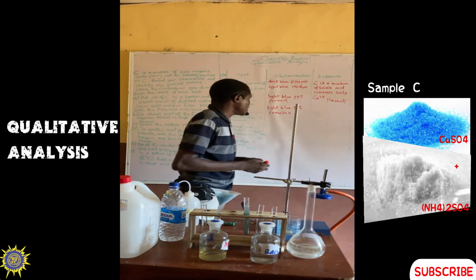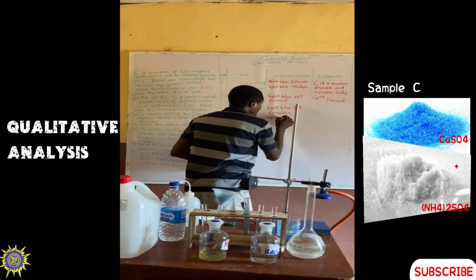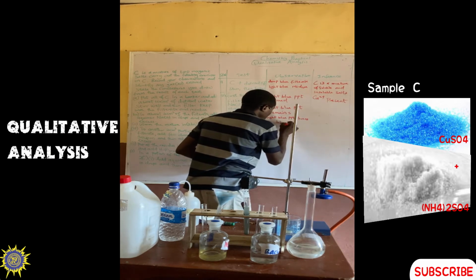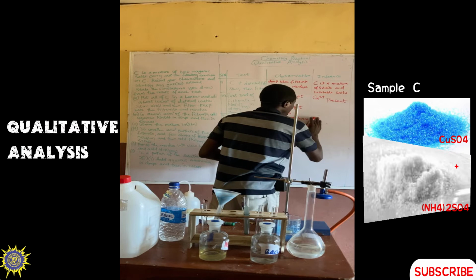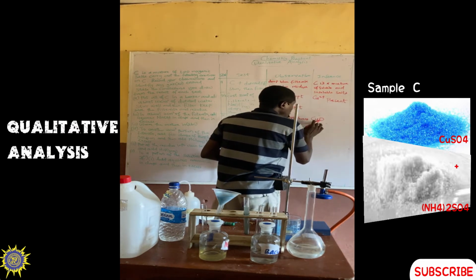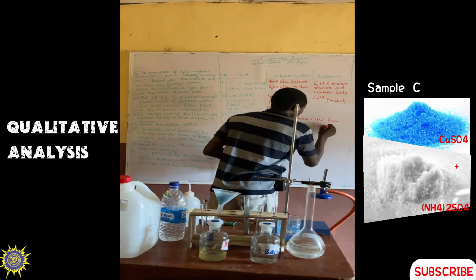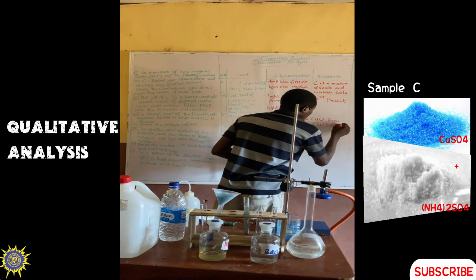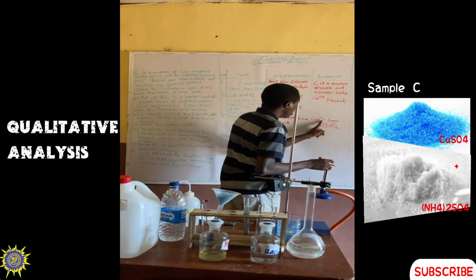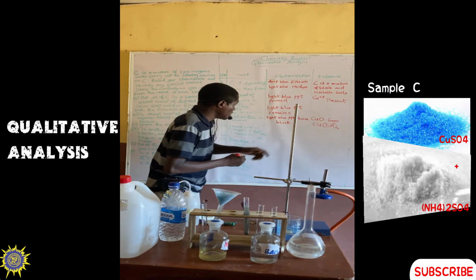So what we are going to write here is that the light blue precipitate turns black. So what does that mean? It means CuO, that is copper(II) oxide, was obtained from the copper hydroxide formed. So that is why the blue precipitate turns black.